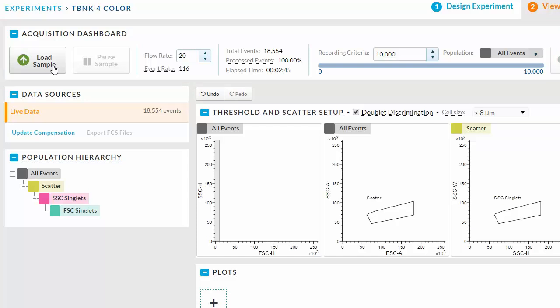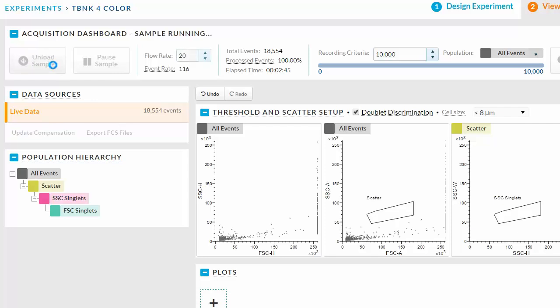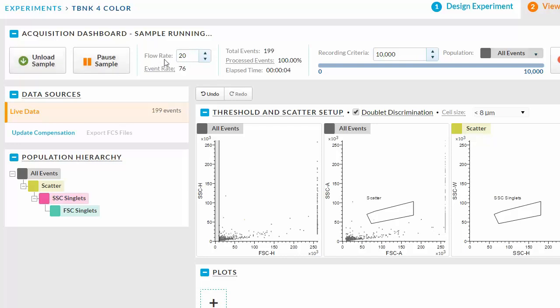Place your pre-sort sample on the instrument and click Load Sample. While the sample is running, adjust the flow rate as needed.